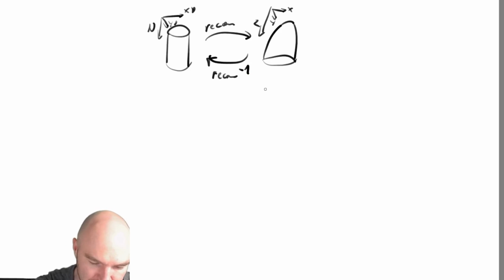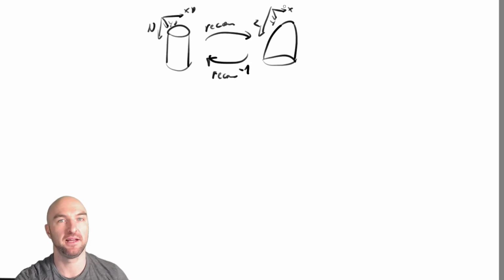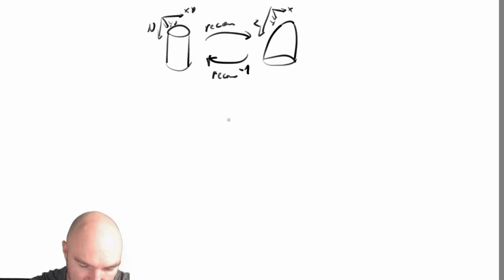So how do we do that? The way we do that is by using an approximation. That approximation is by using the coordinates that we know about. The coordinates we know about are the atomic coordinates. We know the atomic coordinates both in detector space and in reconstruction space. So what we can do is take the coordinates that we only know in reconstruction space, which are object coordinates, and interpolate between the coordinates in the detector space. And the way we base it is that neighborhood relationships are not broken.